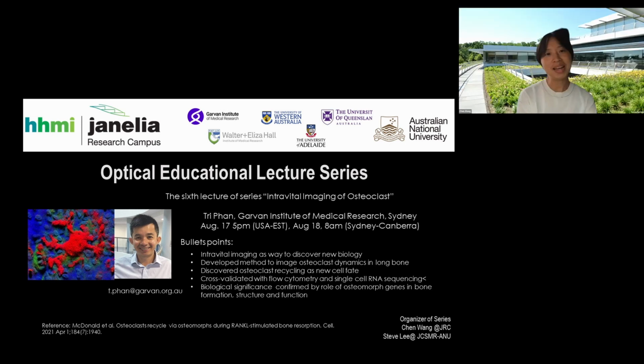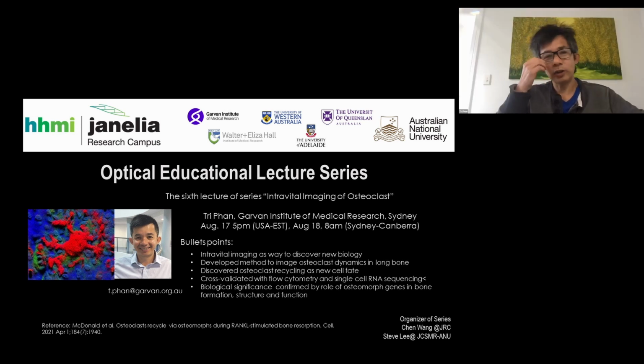Cool. My last question may be very naive. You mentioned you use the dye to label the different types of cells. Since you are doing in vivo imaging, would that be toxic to the sample? And in the future, if you want to do the test on humans, I don't know if that's the plan. So yeah, with the humans, you're right.